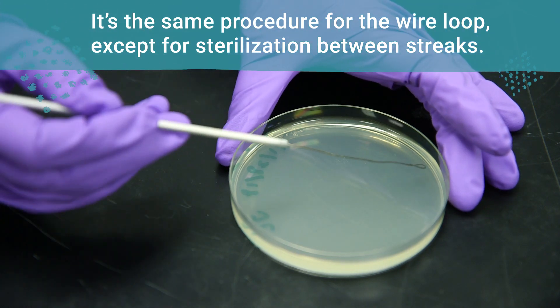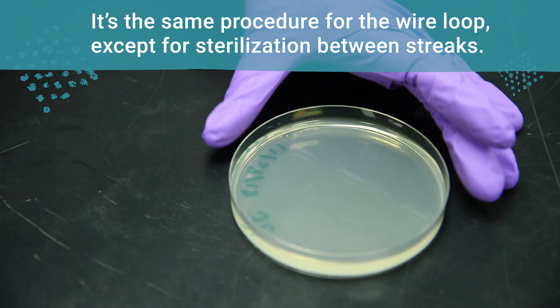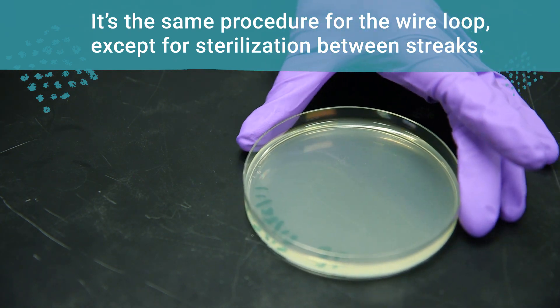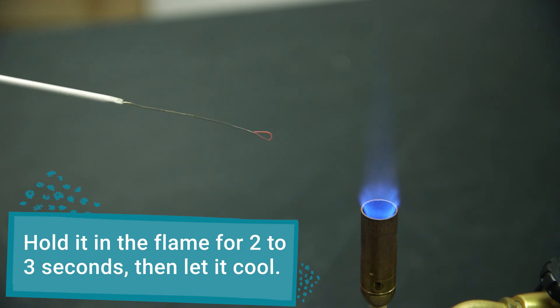If you're using a wire loop, the process will be exactly the same, except you need to sterilize the loop in between streaks. Hold the wire loop in the flame of the burner for two to three seconds, then be sure to let it cool before touching the cells.